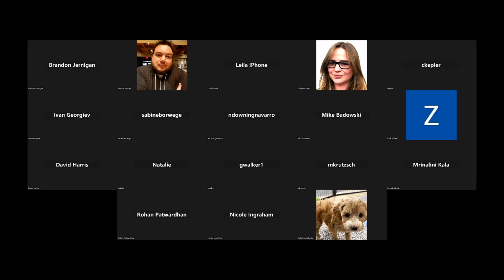Hey Rohan, I have a question. You mentioned that we can actually pull out and store our SOPs, forms, or whatever documentation we have in terms of other clinical data information. Is there a way we can manage those things? Because normally what we do is we review our SOPs every year, whatever changes are there. So is there a way to archive them and manage all those forms and SOPs in there? Is there a way to do that?